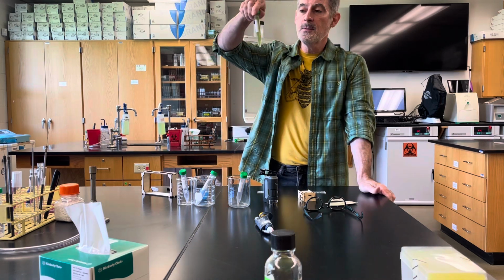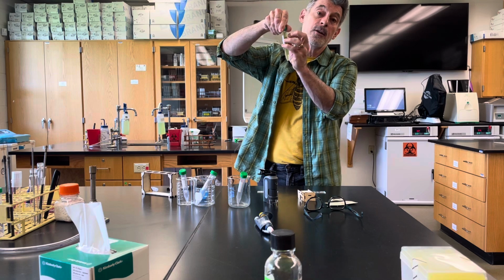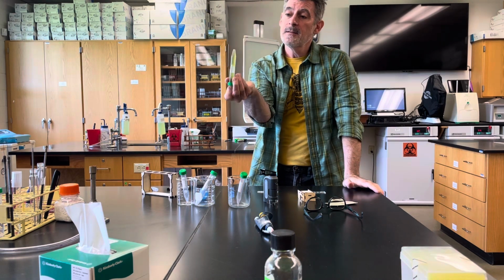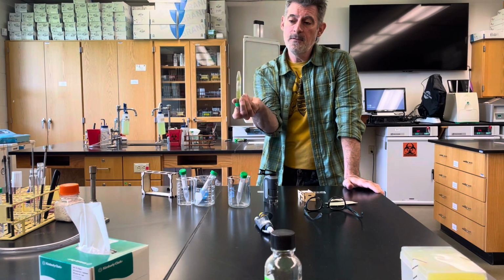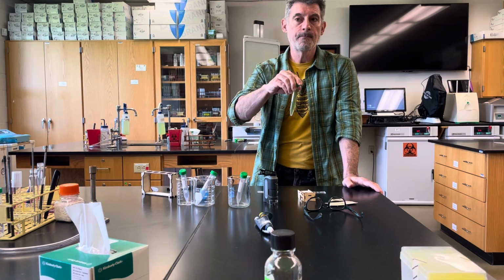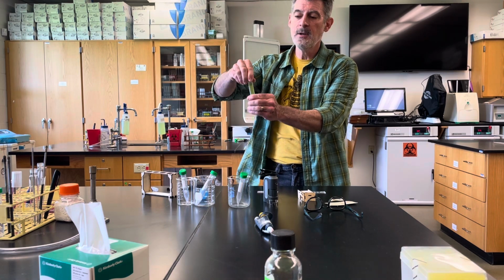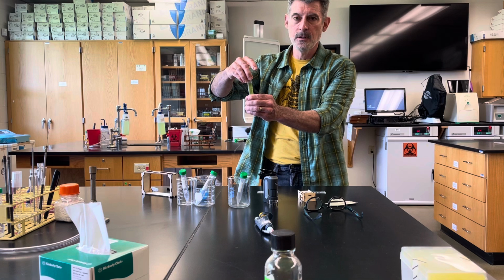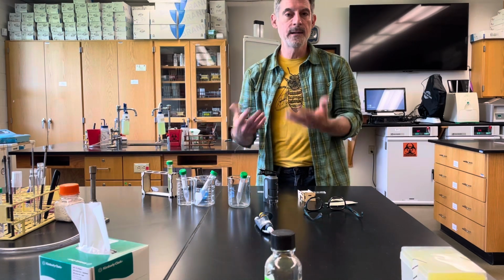If you look at your tubes over time, you may notice it's very green on the bottom and a lighter green throughout. Some of the cells are motile, so they will be swimming around, but you should invert it like this with the cap screwed on tight to kind of mix them. When the tubes are just sitting and you're not doing anything with them, you should loosen the caps so they're loose. Okay, so the cap shouldn't be tightened when it's just sitting there during the experiment.